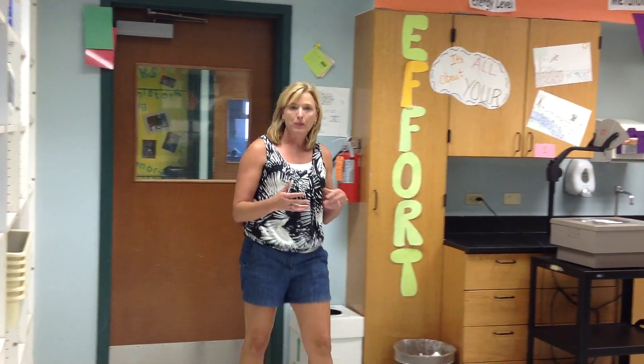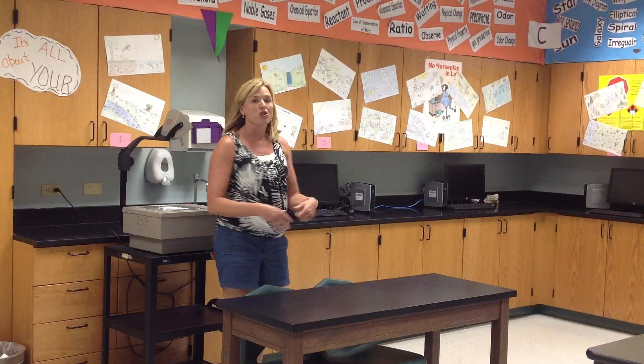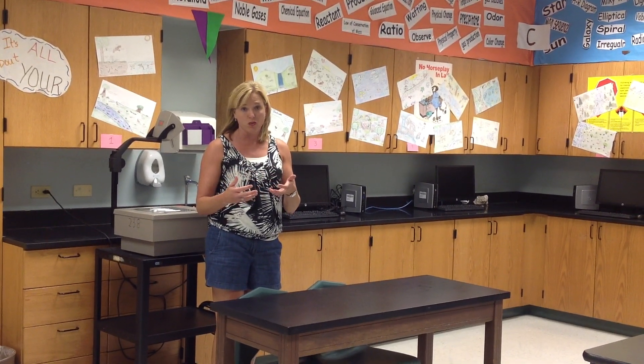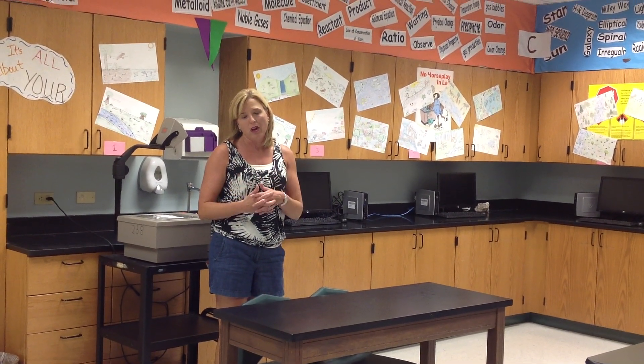Believe it or not, the best piece of safety equipment in case of some type of injury would be the sinks that we have throughout the room. If you get chemicals or anything on your body, simply wash your hands, rinse, and everything should be fine. Also, whenever we work with chemicals, it's important to wash your hands after you're finished with the lab, because you never know when you're going to touch your eyes or your nose, and that could cause irritation and possible injury.